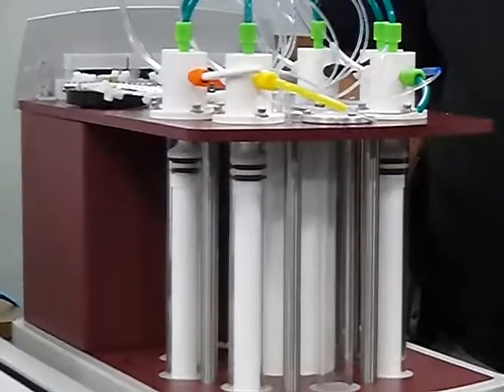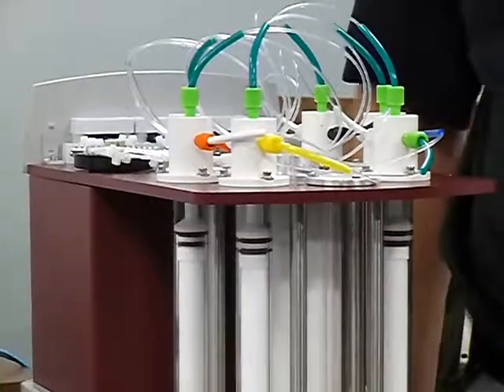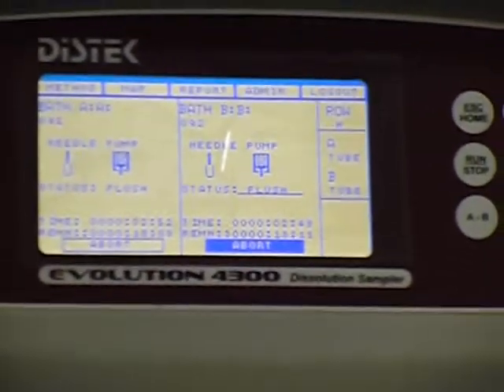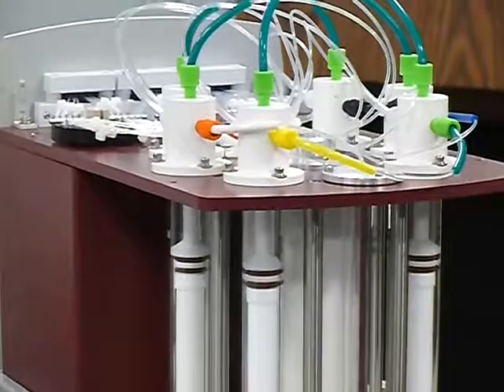You slow it down, speed it up, and then you can say, okay, well, yeah, you can run for 5 mils or do a pull every 5 minutes, but you've got to run at 15 mils a minute, and you've got to cut down your offset instead of 3.5, maybe make it 3 or only 2. And there, if you're not concerned with the exact volume, which people that run test tubes, they just want enough for UV.